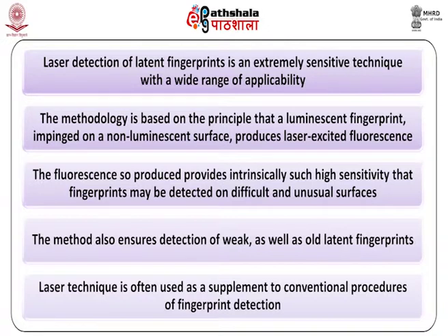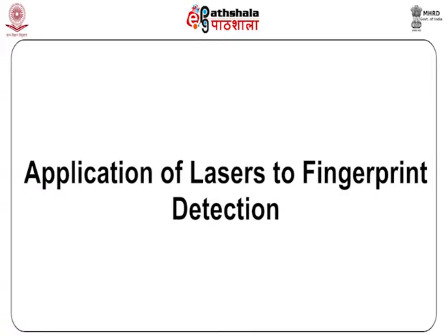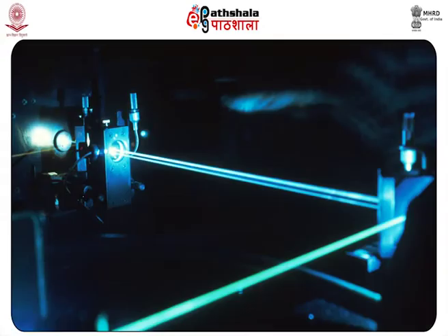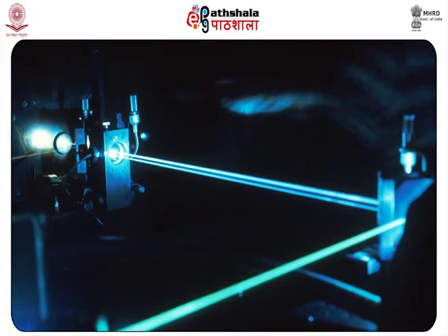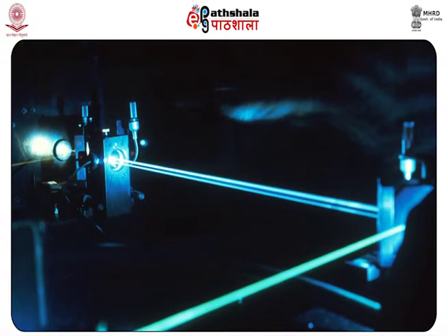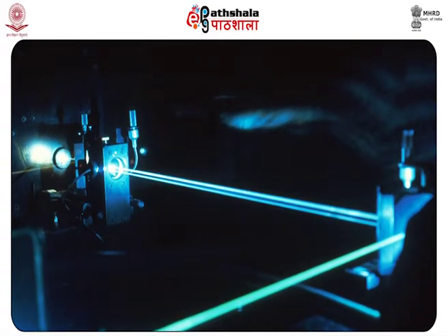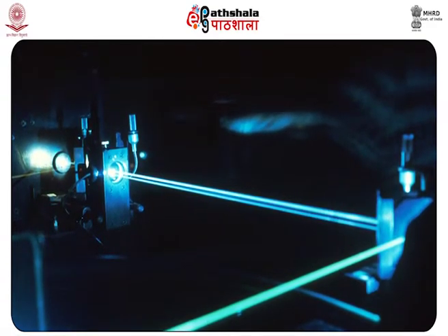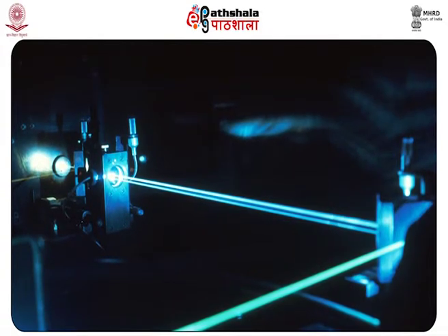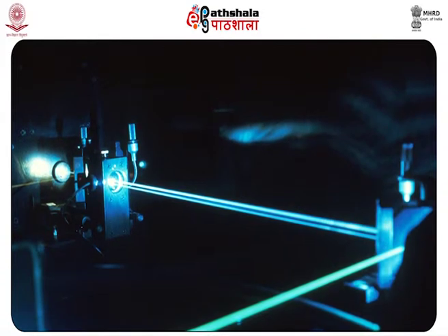Laser technique is often used as a supplement to conventional procedures of fingerprint detection. Let us now have a look at application of lasers to fingerprint detection. The most common device used for the detection of latent fingerprints on difficult surfaces is the argon laser. The surface impinged with the finger mark is illuminated with a blue-green beam from the argon laser. Before it strikes the surface, the beam is made to pass through a lens.